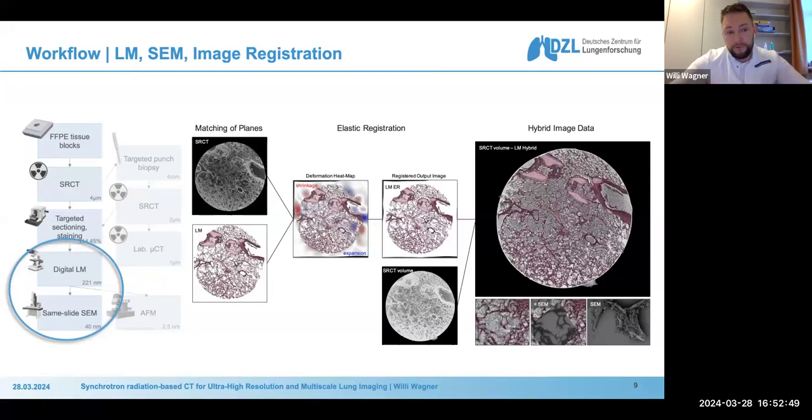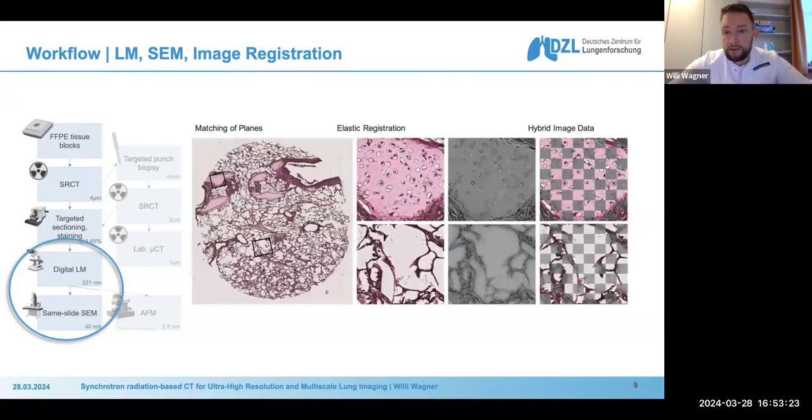And if you are still not satisfied with the amount of information that you have, we have developed a protocol of doing electron microscopic imaging of the same tissue slice. First you do your specific staining, and then by a protocol of heavy metal impregnation and sputtering on a charged glass slide, we conduct electron microscopy to really get into the ultrastructure of the tissue.